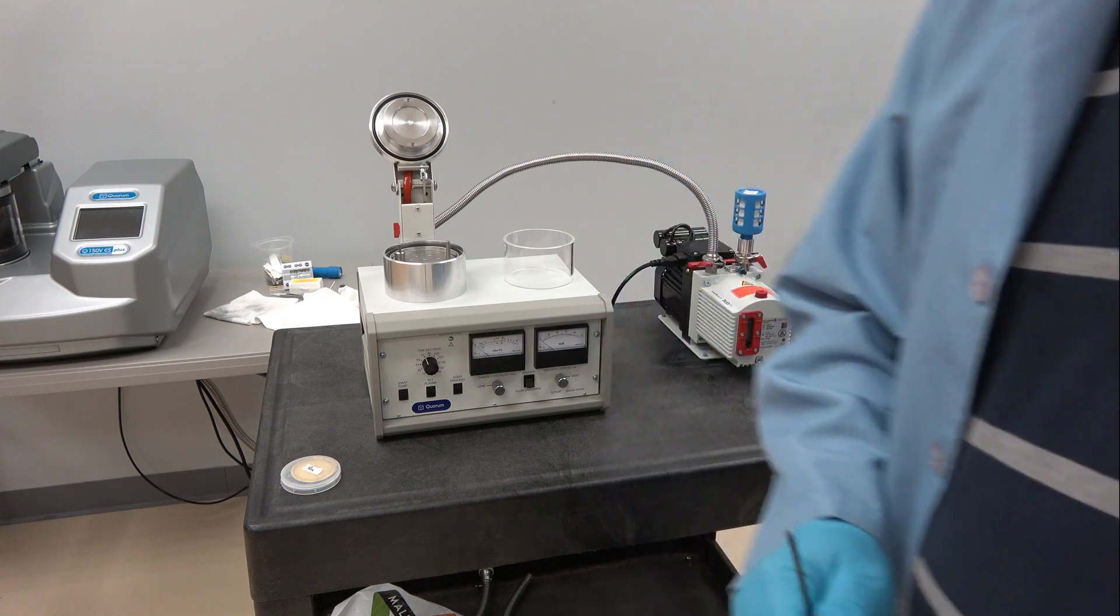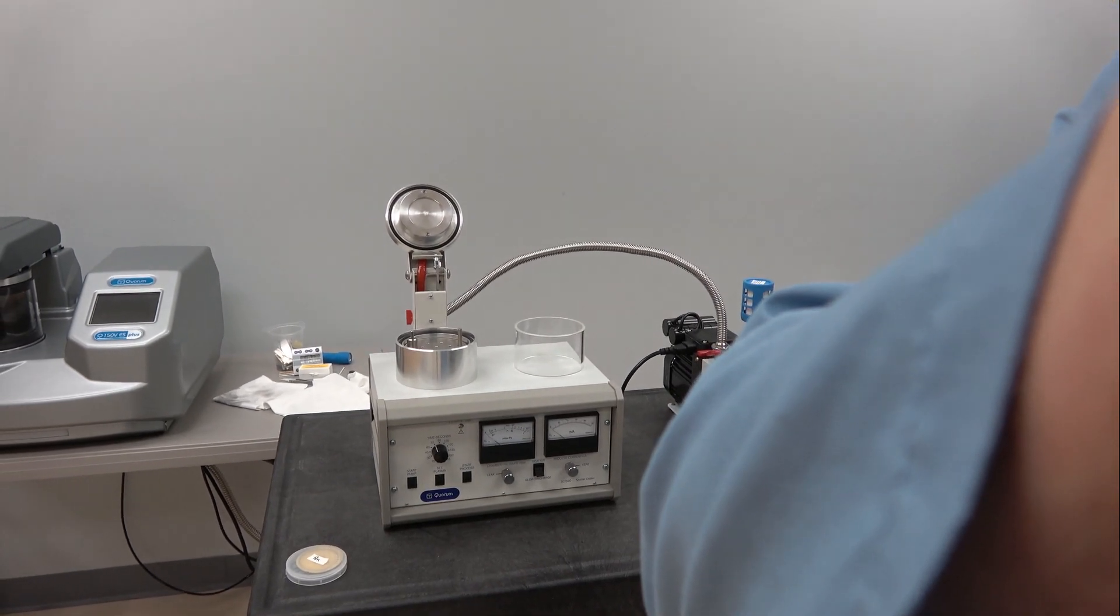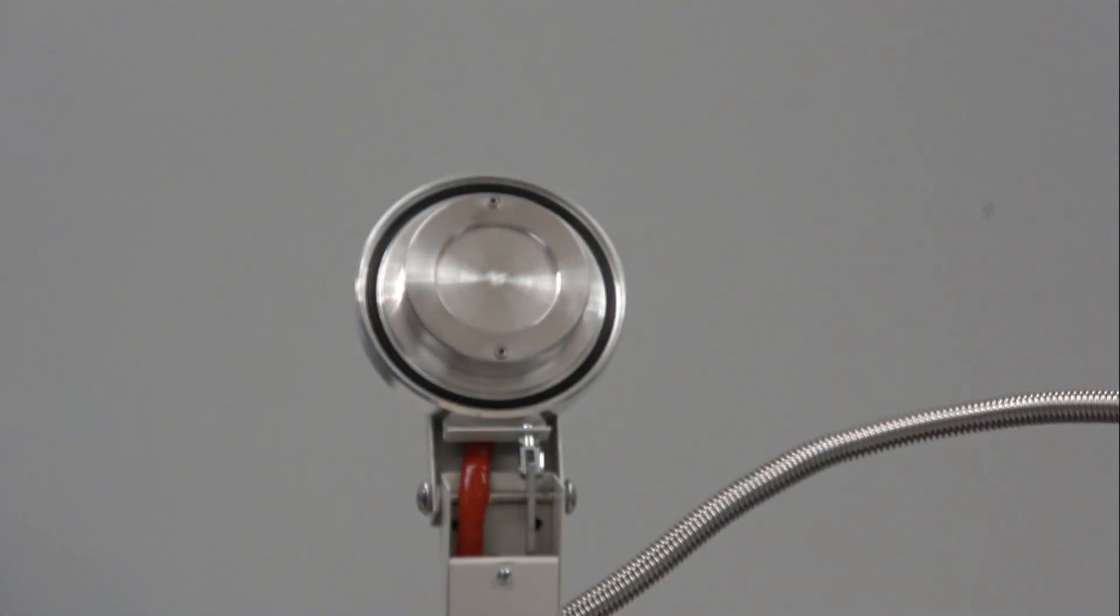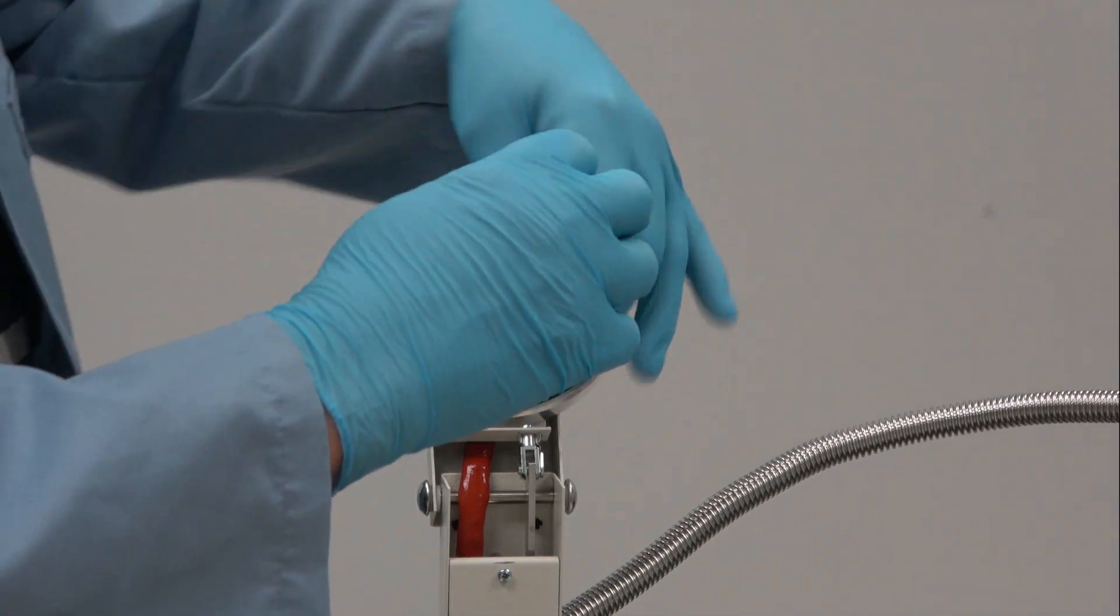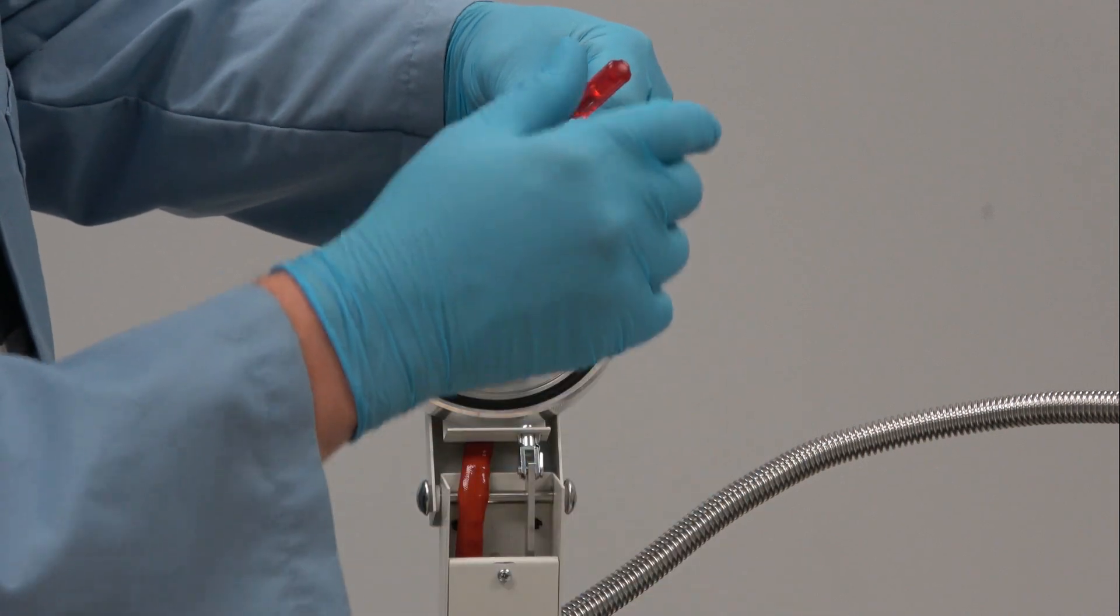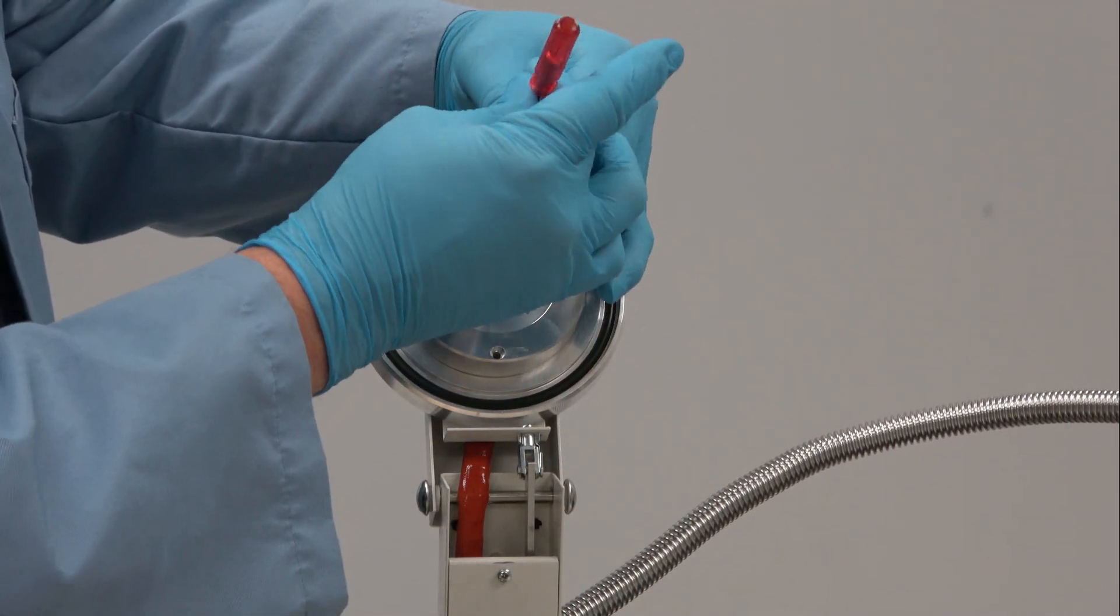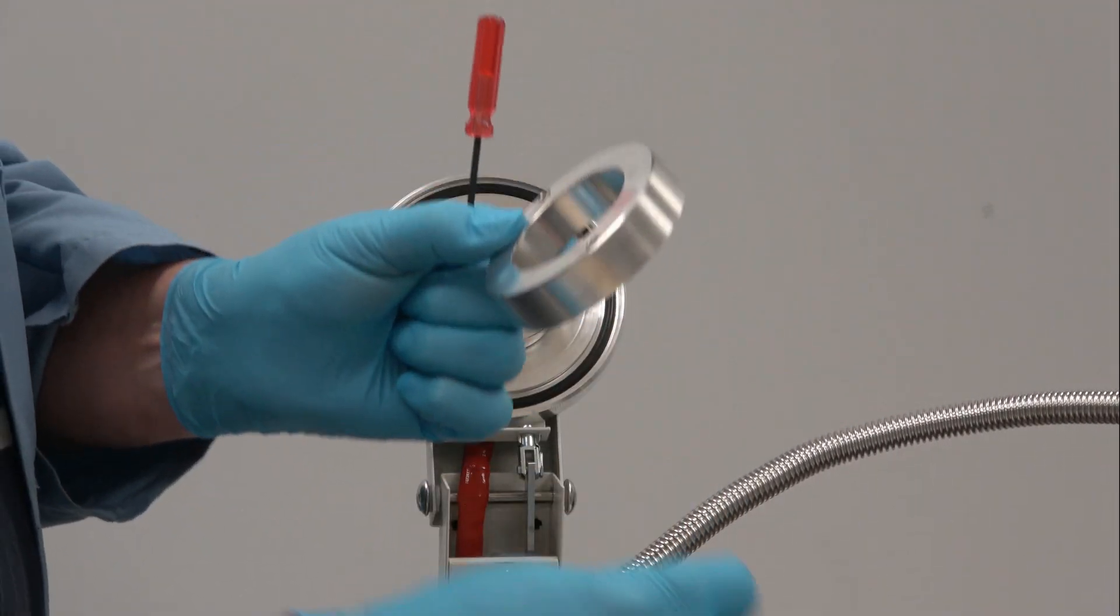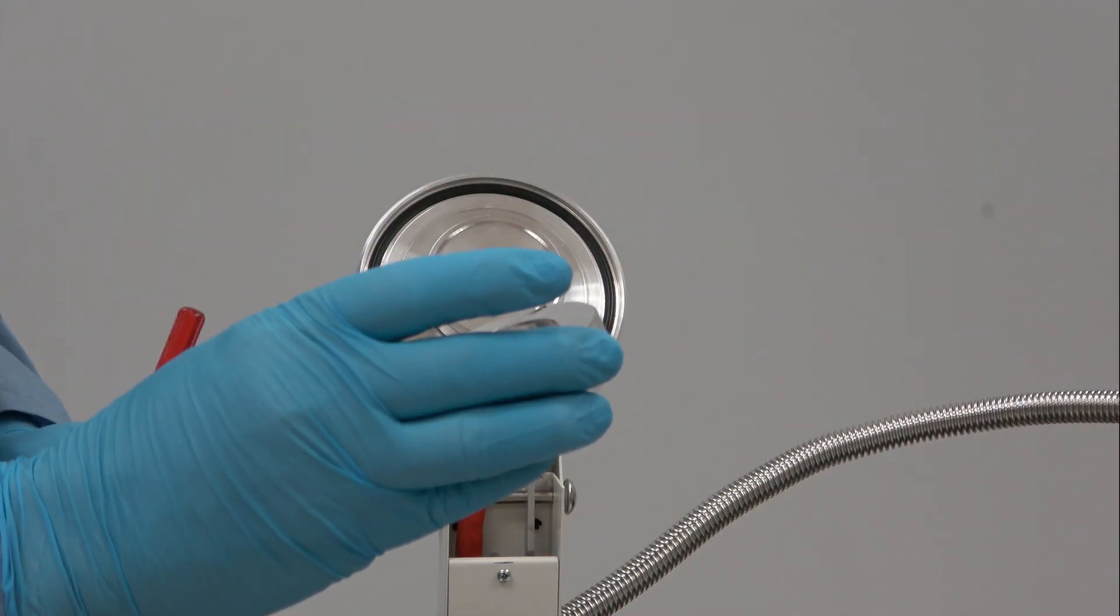So where the confusion begins is here on the sputter head. As you can see, there's two hex head screws to remove. They're 2.5 millimeters. You take them out and you remove the entire shield, which is known as the dark space shield.